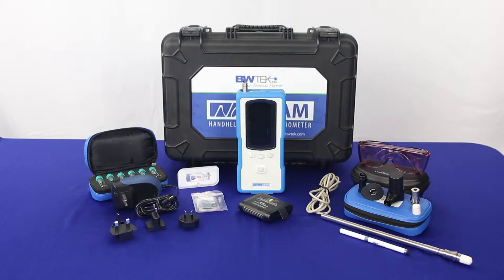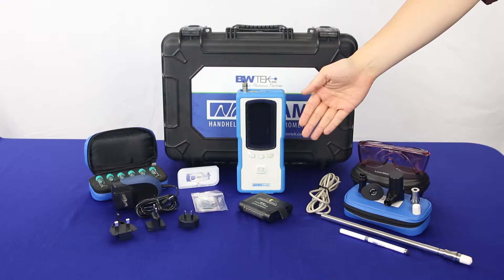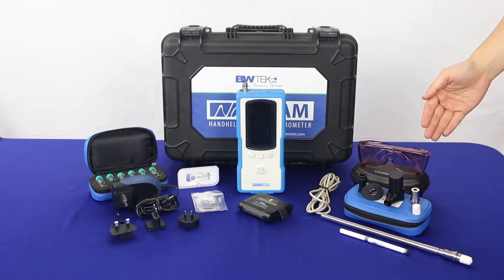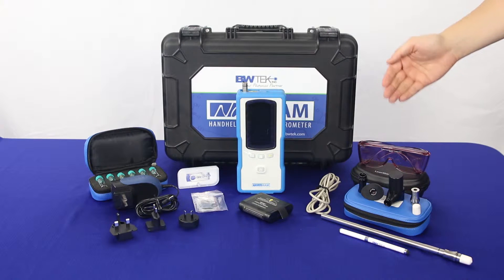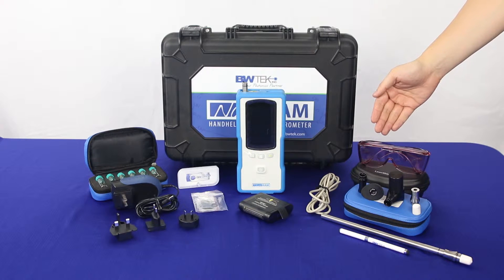When you receive your NanoRam, it will come packaged with the following: one protection cap, a lithium-ion battery, one accessory pouch that comes with a point-and-shoot adapter, a liquid vial holder, a bottle adapter, and a polystyrene calibration cap.